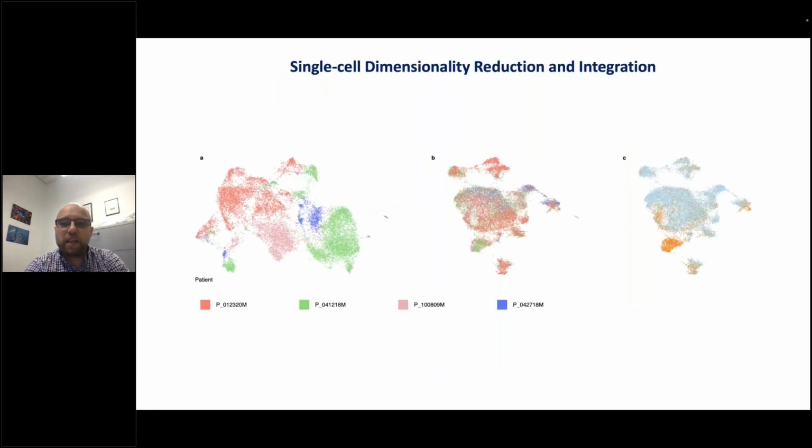The next step we call the pipeline dimensionality reduction, but what it is supposed to do is to normalize and integrate the data so that the same cells will fall in the same cluster, even though they come from different samples and might have been sequenced to different depth.